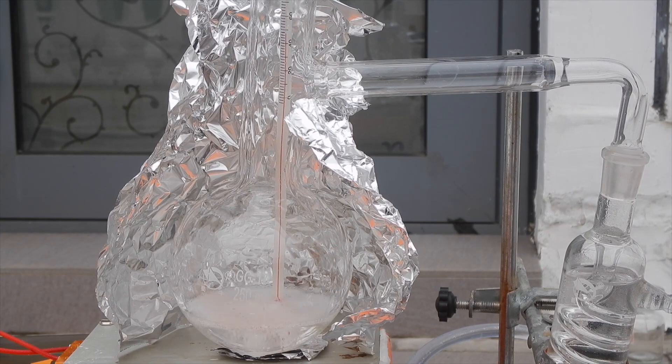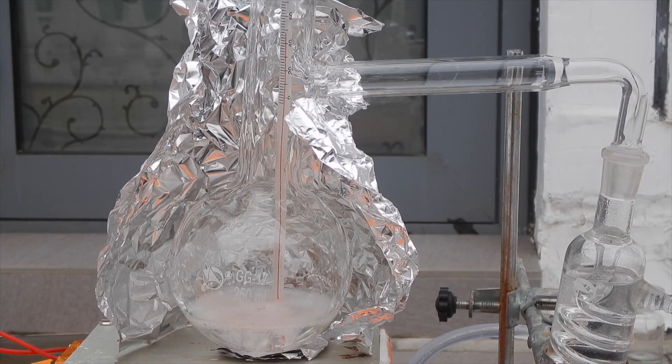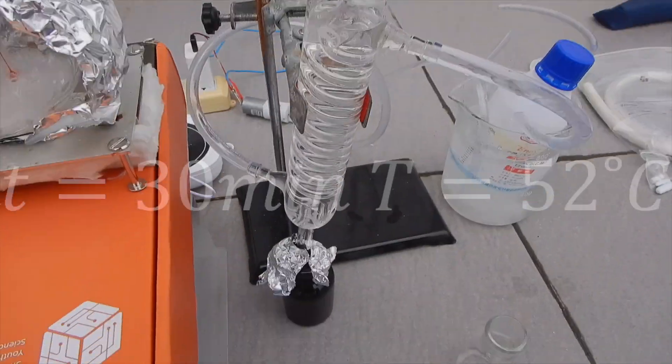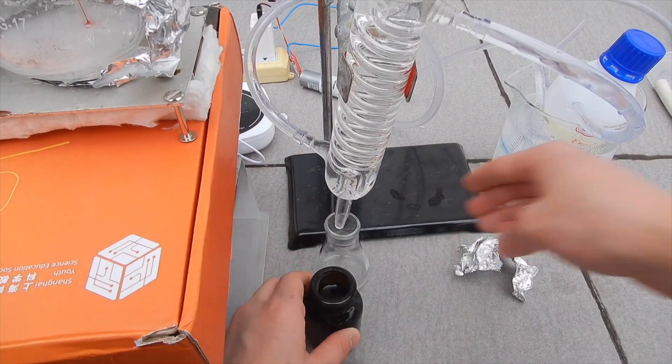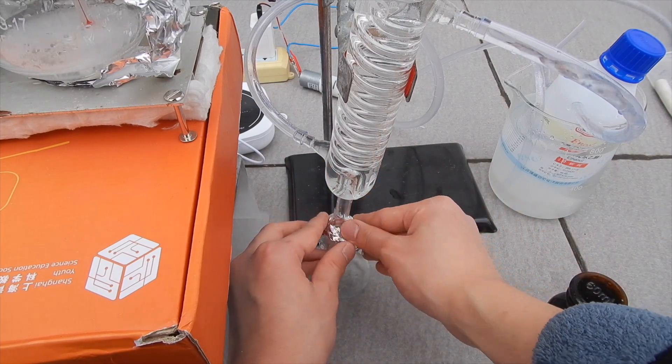However, I didn't observe the sudden temperature spike. Probably my car starter fluid has other low boiling point ingredients. When the temperature reaches 52 degrees Celsius, I decided to swap out the receiving flask. I wrapped the mouth of the flask in aluminum foil to reduce evaporative losses.